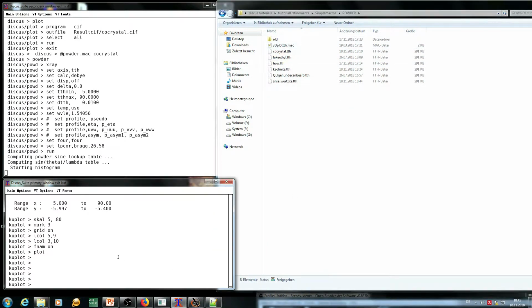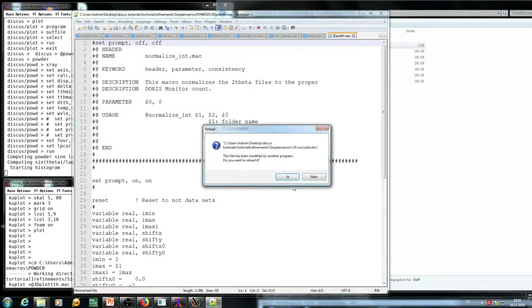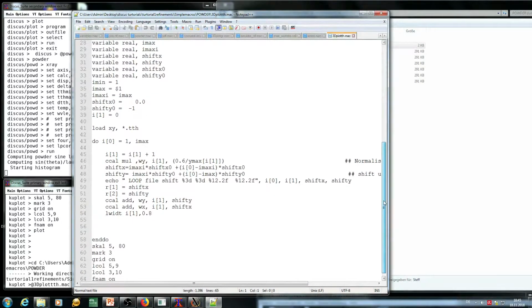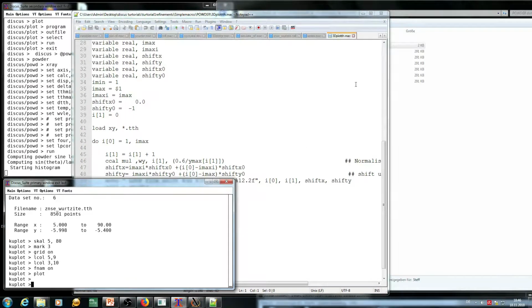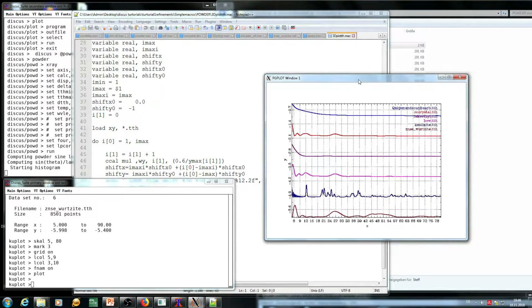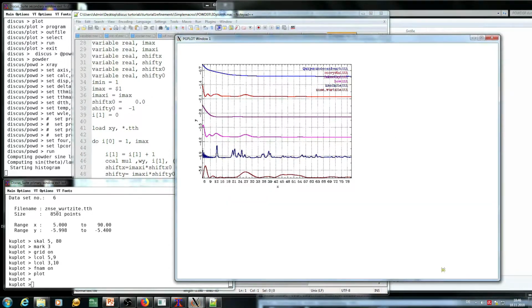Okay, so what we can look at now, for example, is the powder data. When we go now to the cuplot and run the fancy 3D plot macro I wrote a few weeks ago, you can just look into those files. It pretty much calculated 6 patterns and shifted them a bit so we can easily see what we created here with other files.